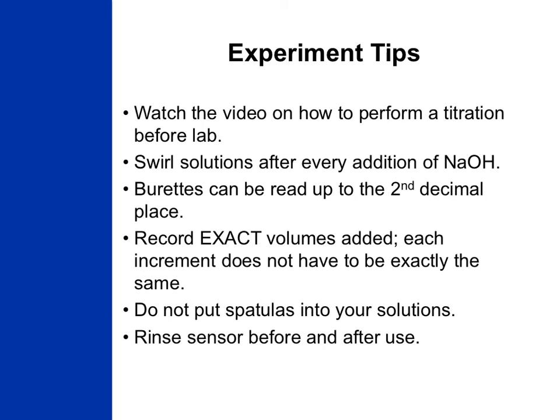Don't worry if you don't fill the burette exactly to the line, that simply wastes time. Write down what the volume is in your lab notebook and continue on with your lab work. Please also do not use spatulas or glass stir rods when stirring the solution, as this can lead to contamination. Proper technique is to use your wrist to get a nice and even swirl. Please also make sure that anytime you put the pH probe back in the storage solution or you're switching solutions, you rinse it with some DI water.